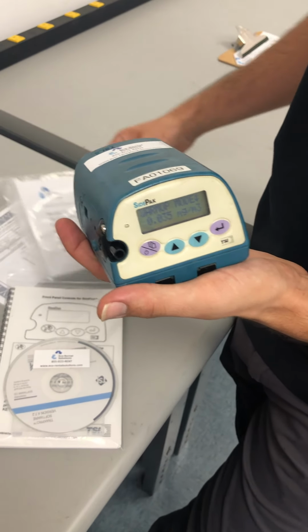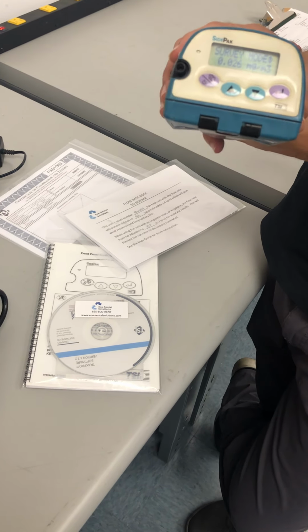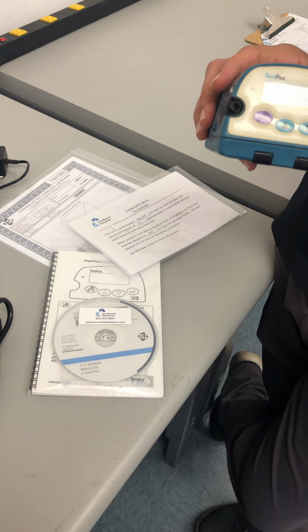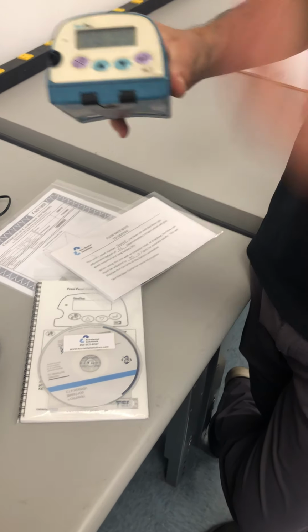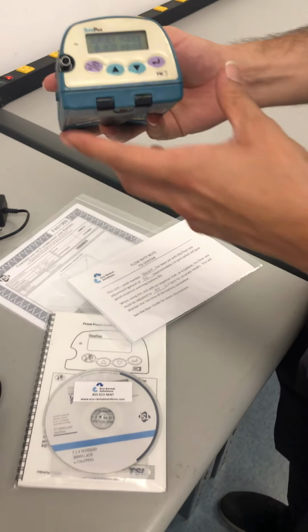So we're not going to be using data tracking for this purpose. It'll just be a grab. The survey mode does not data log. Okay, good. We don't need it. Yeah. Judging by the way you explained it, it seemed like this is probably going to be your best option. Just why confuse things, you know?